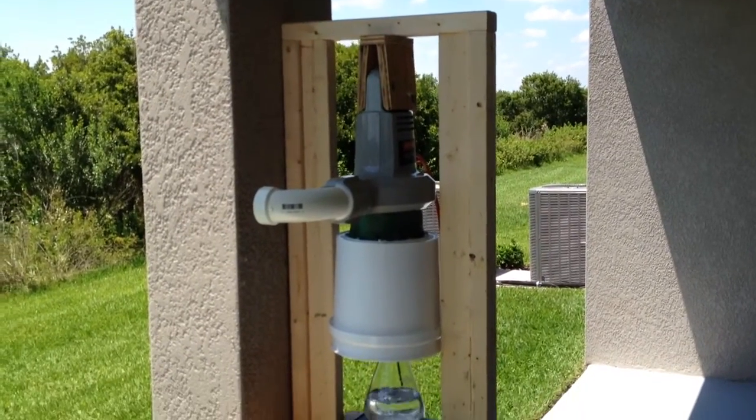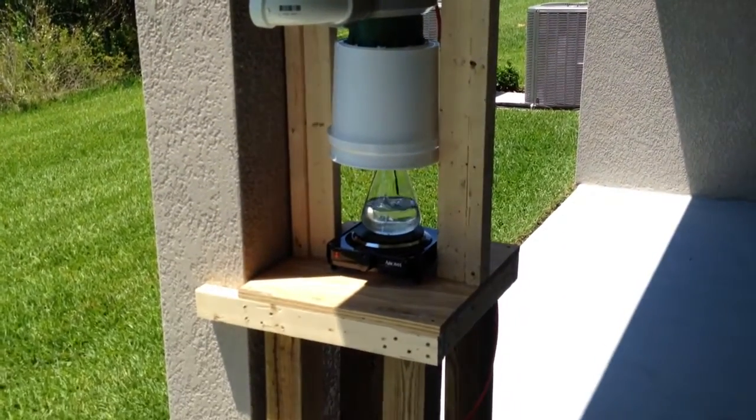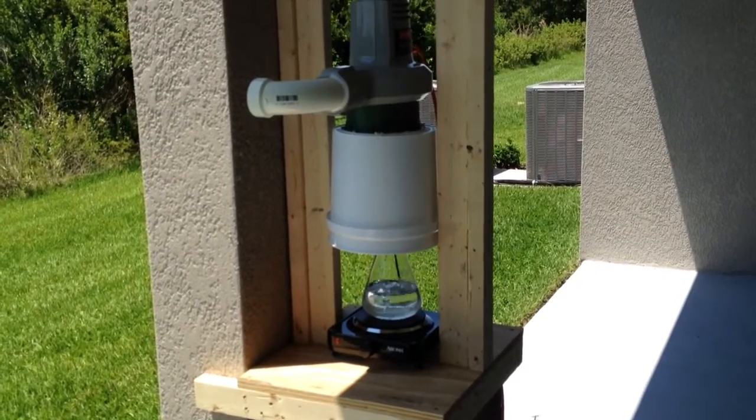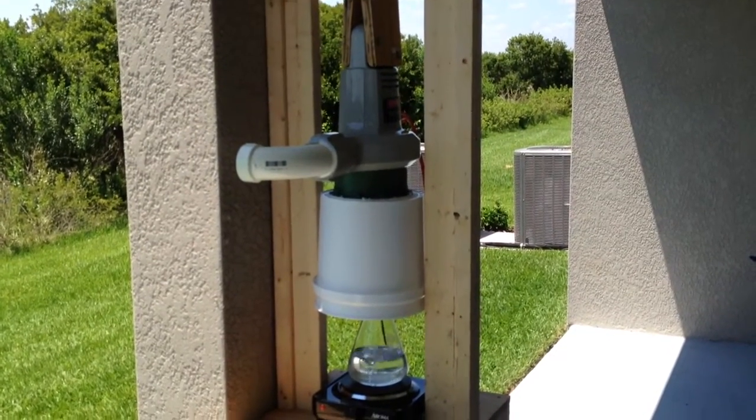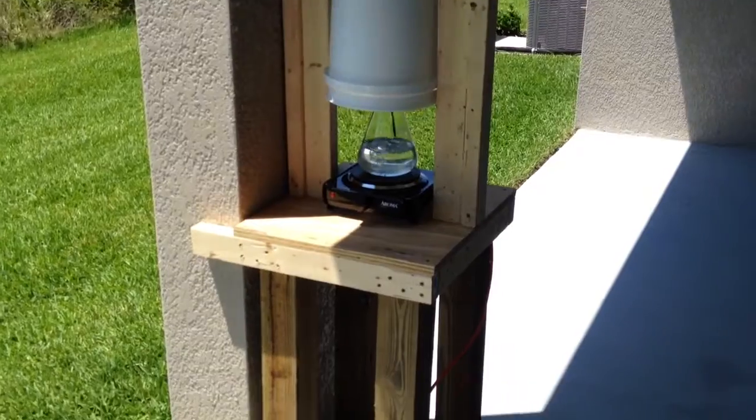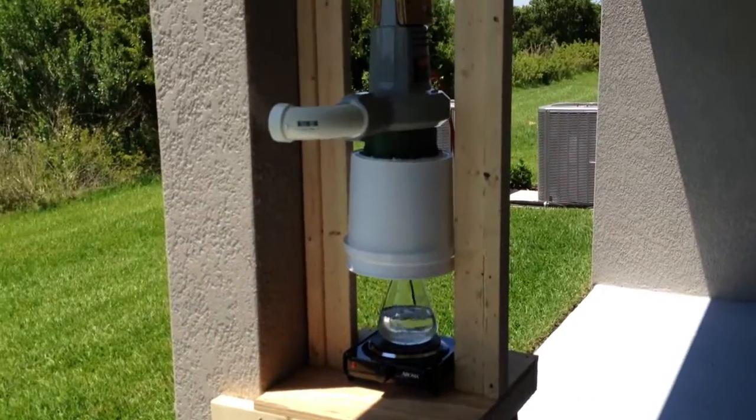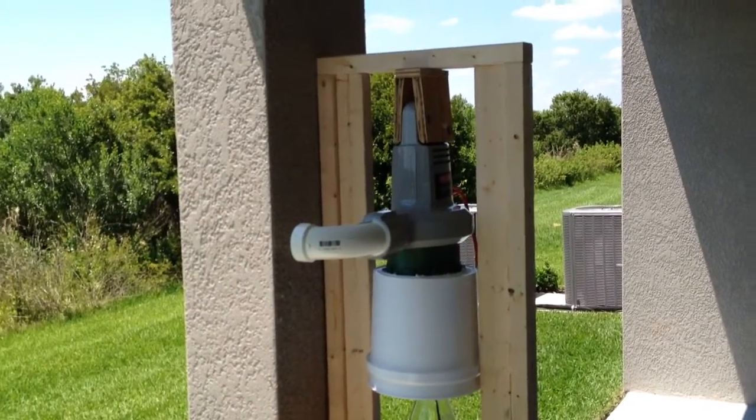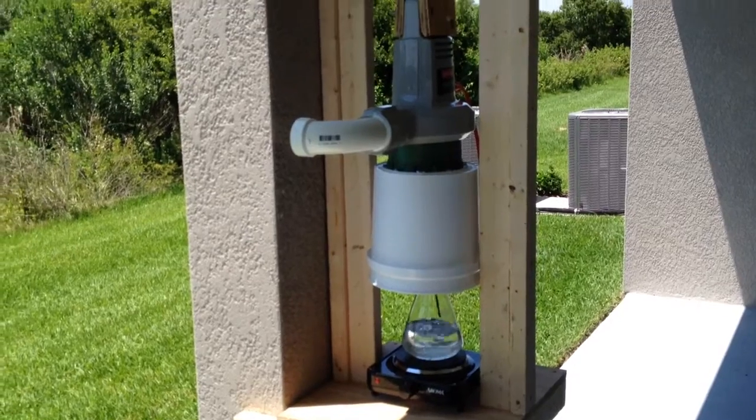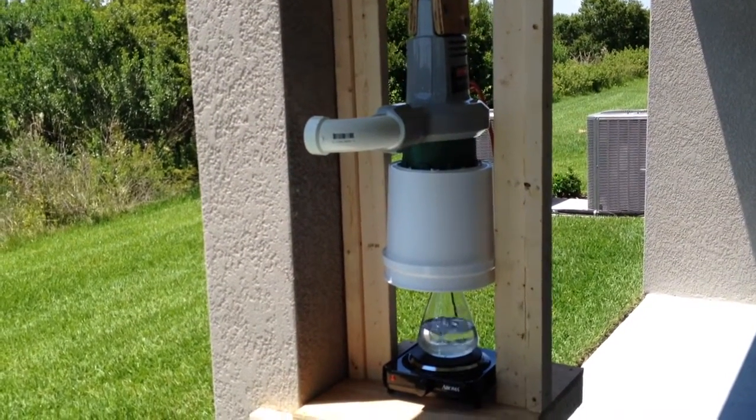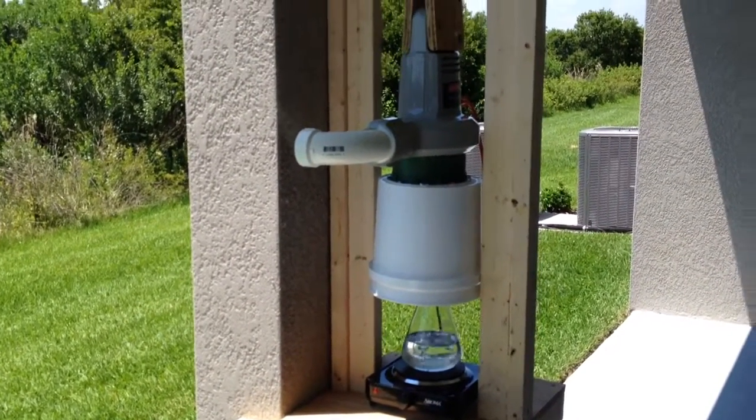This took me about four hours to build altogether. It cost maybe $20 to $30 in parts. This is something that anybody with a fair amount of tools and know-how can build, and I think it provides a lot of safety for people who are doing this as a hobby. Take care.